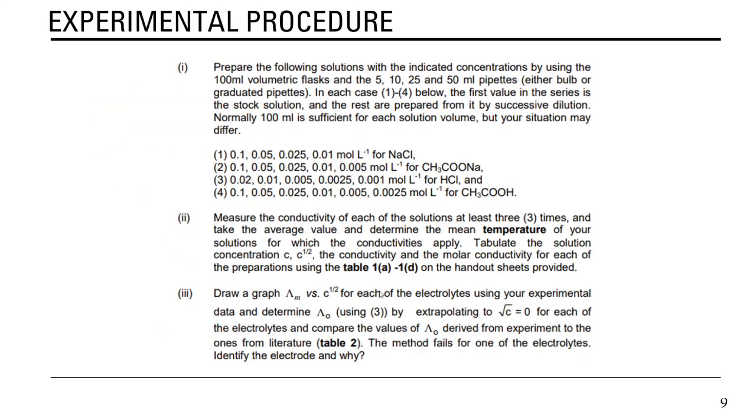Okay, right, so I don't want to highlight the experimental procedure. It's pretty much very straightforward. Pretty much all you have to do is prepare this. So in the lab you'll be preparing all these solutions, and then you will do the dilution, and then you will start measuring the conductivity of this using the conductometer.